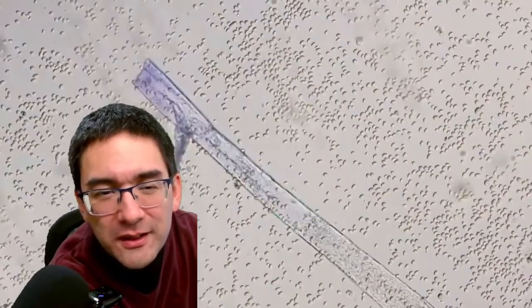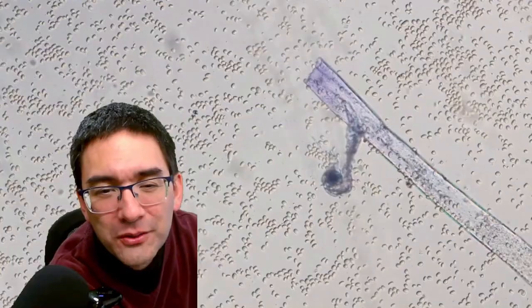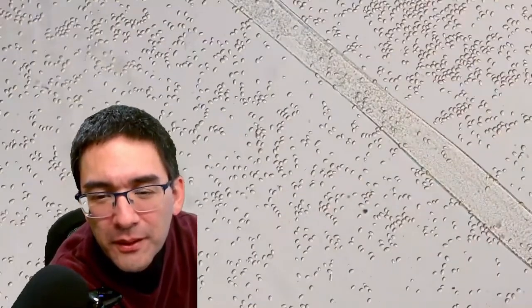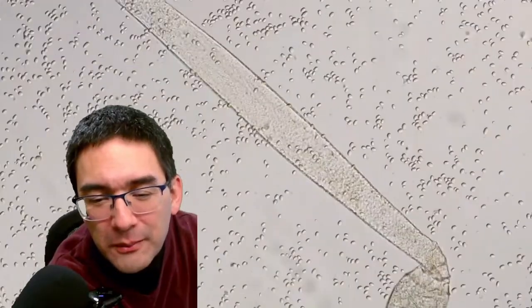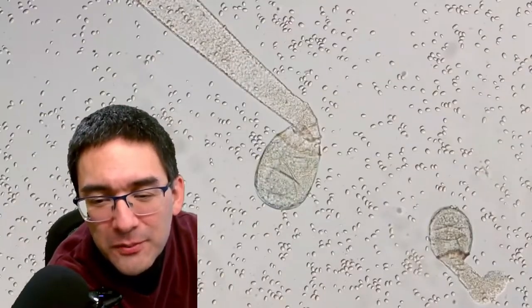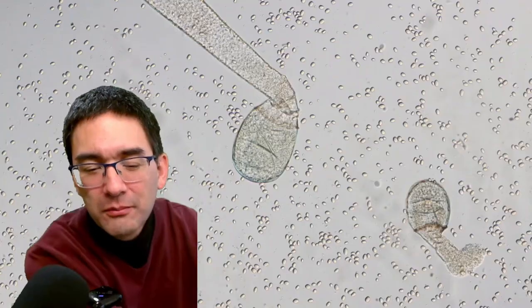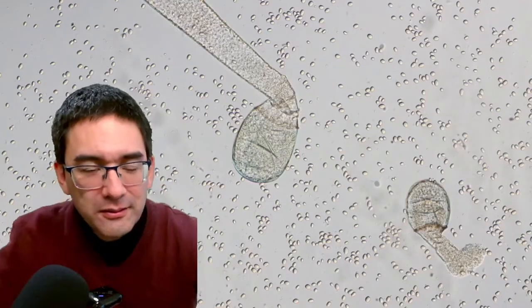So that is also a nice thing. Over here also to observe, to show a little bit that different structures respond differently to the different chemicals that you find in different types of stains. I think I'm going to leave it at that.